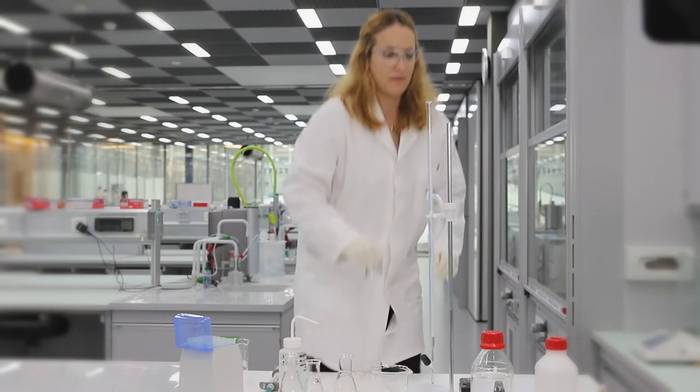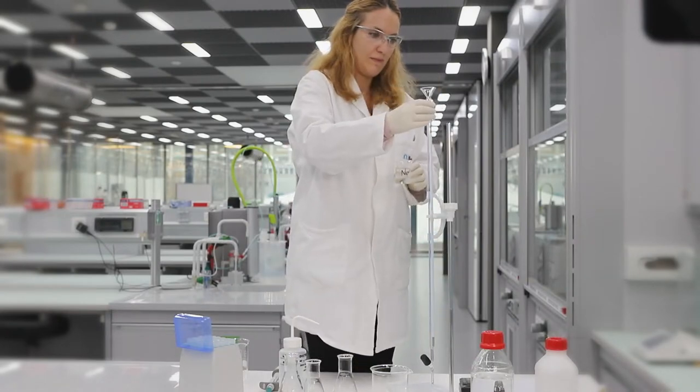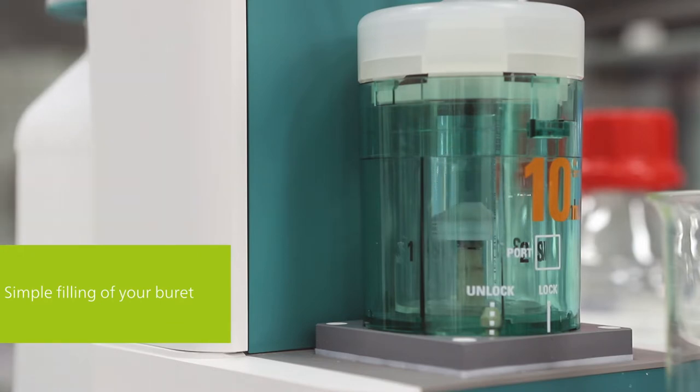My first reason comes already into play before I start the titration. With automatic titration, preparation of the burette is much easier. Filling the burette manually can be tricky, and you have to be very careful when handling corrosive titrants. With an automated titration system, all you have to do is touch a button and the burette is filled. That is simple and safe.